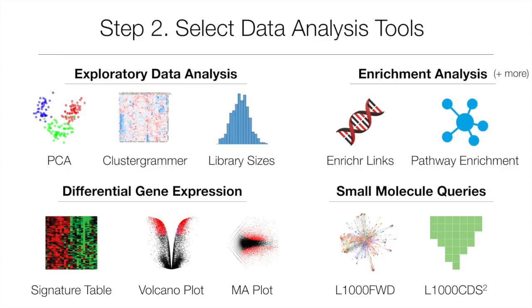After the user has either uploaded or selected the dataset they wish to analyze, they are then required to add one or more computational tools which will analyze the RNA-seq dataset and embed interactive results in the notebook. These tools range from exploratory data analysis to differential gene expression, enrichment analysis, and small molecule queries. For more information on selecting data analysis tools, see video 5 of the playlist.